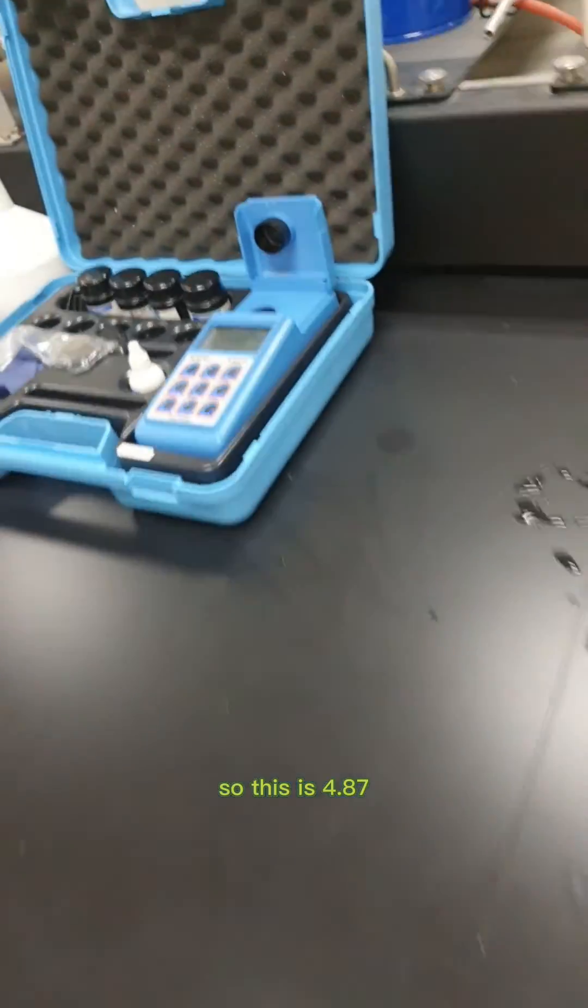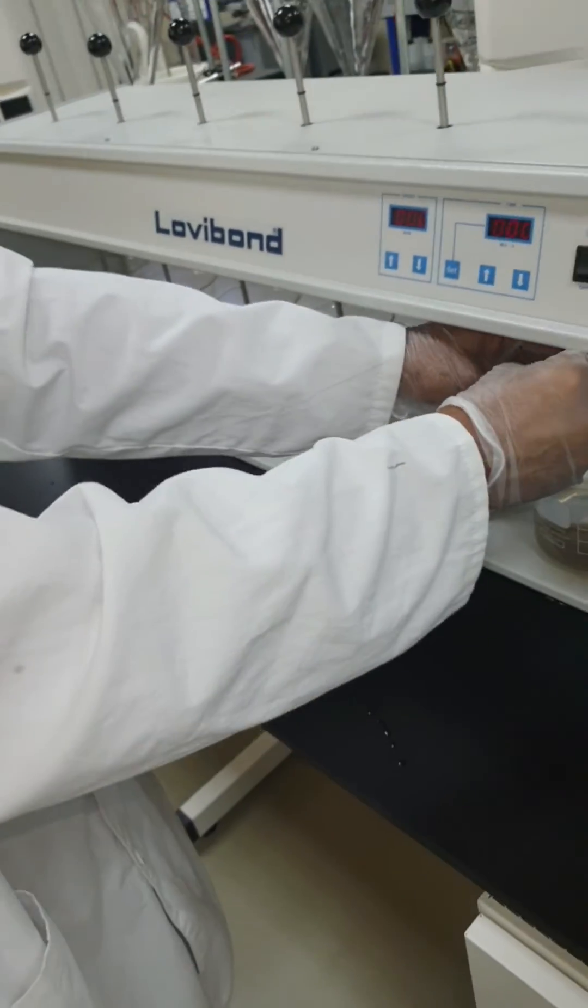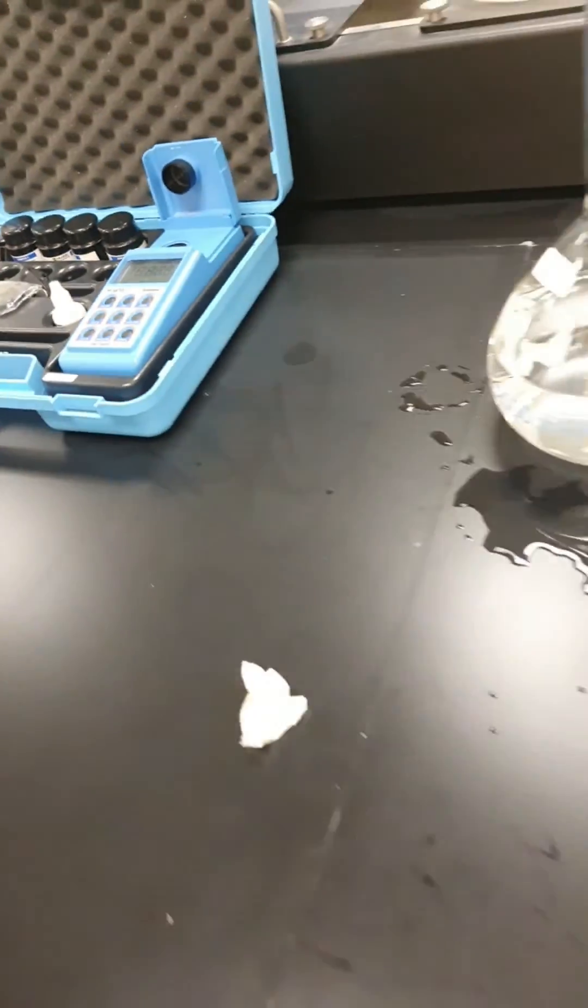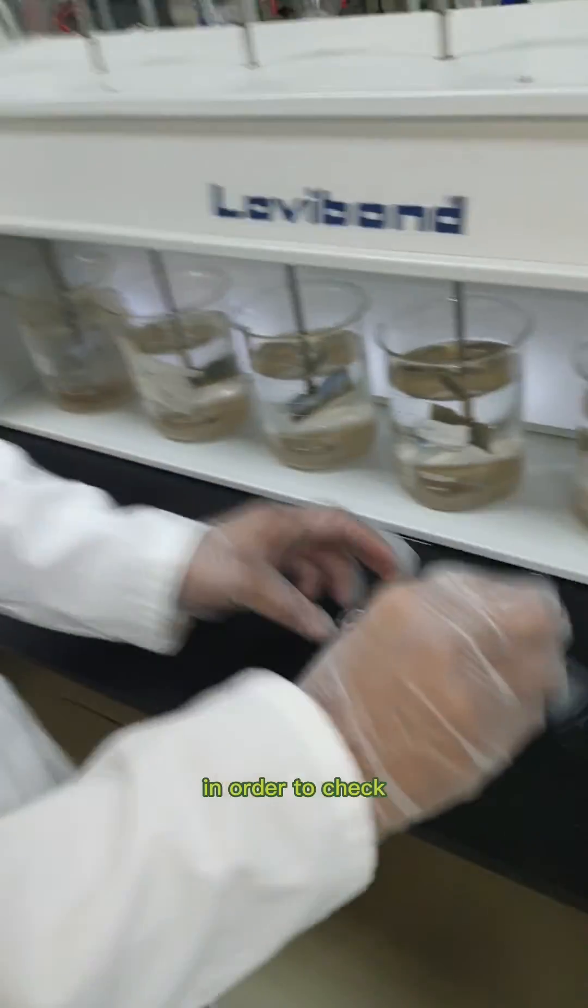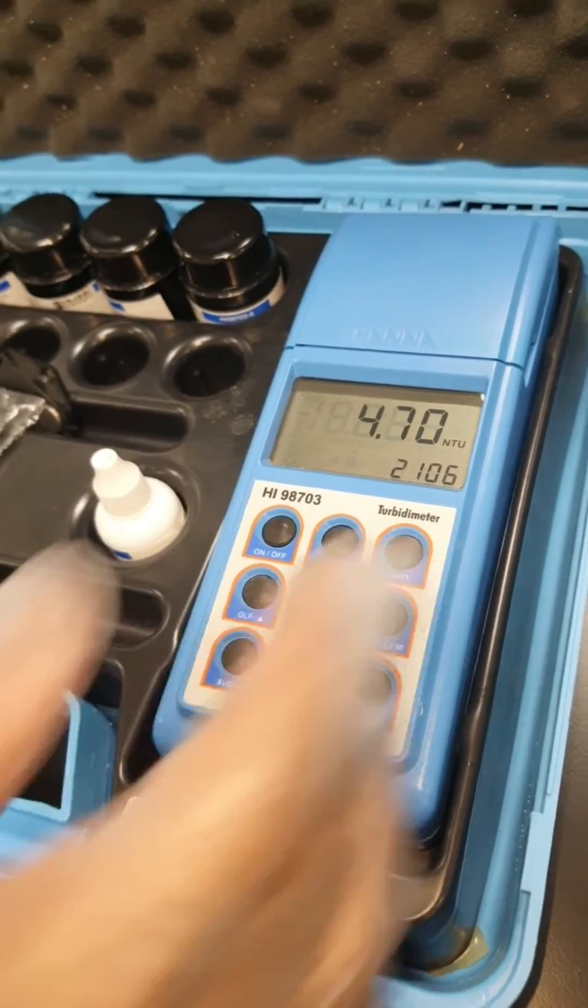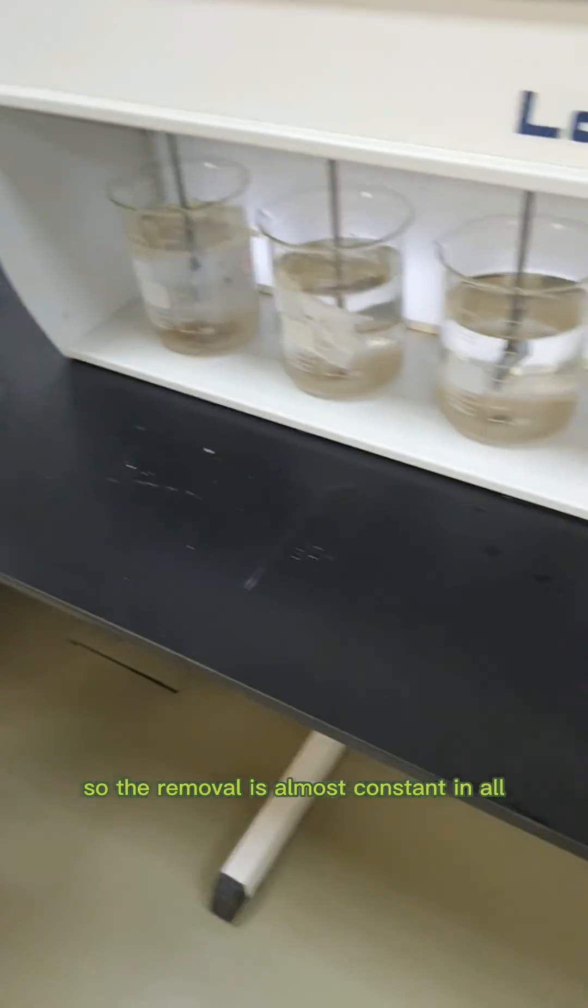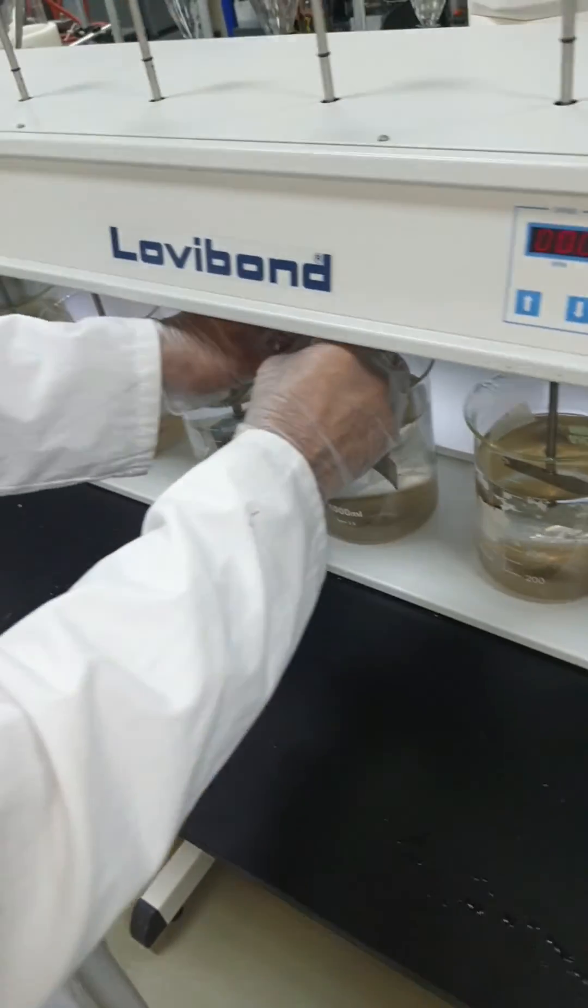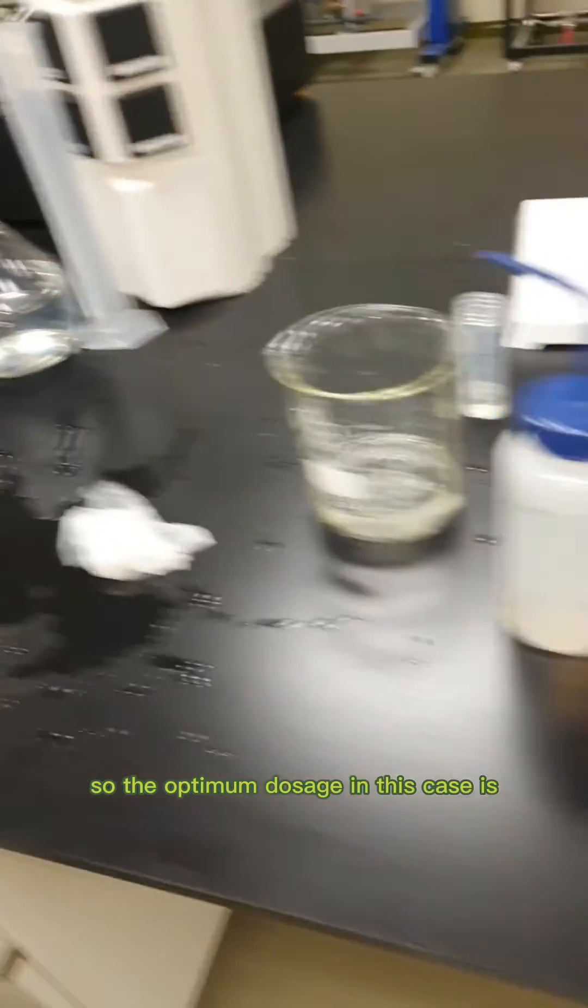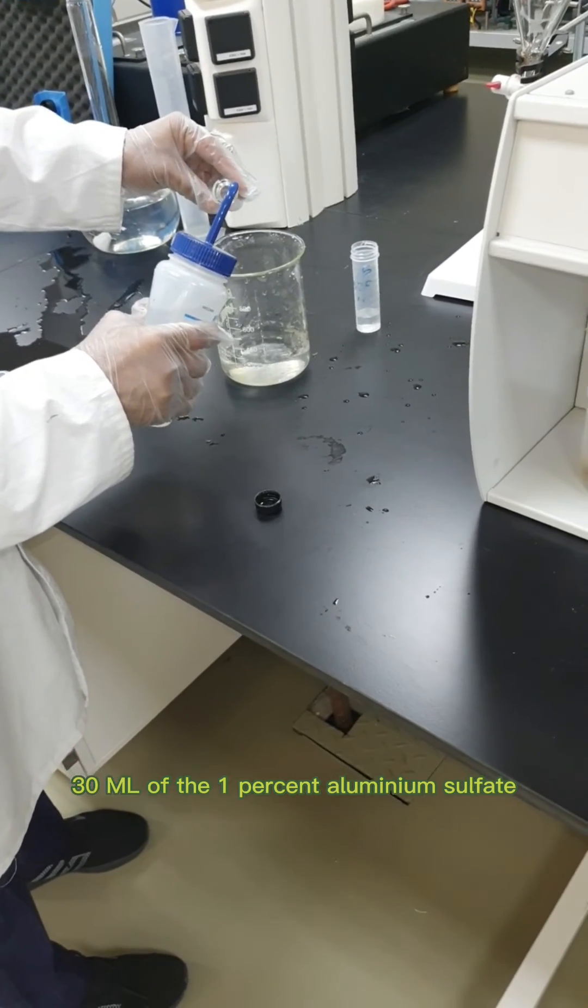This is 6.35. To confirm, we will check the second to last one also. The removal is almost constant. We will check one more to confirm. The optimum dosage in this case is 30 ml of the 1% aluminum sulfate.